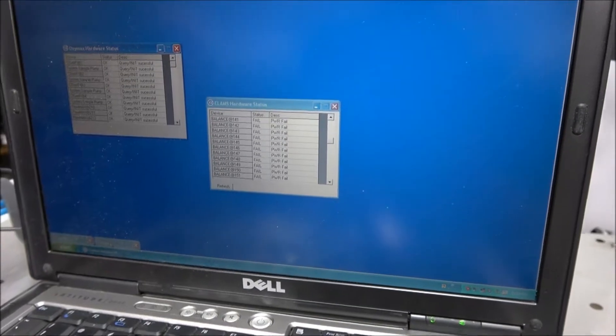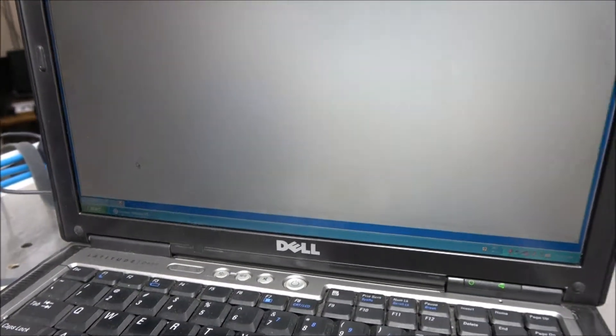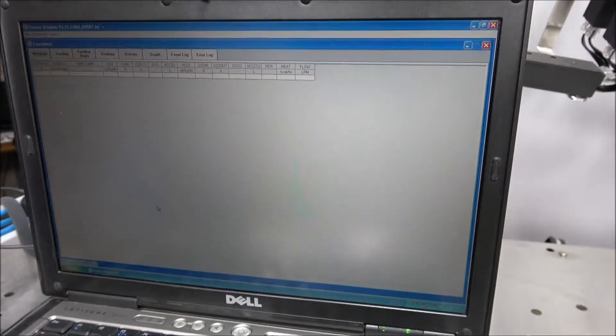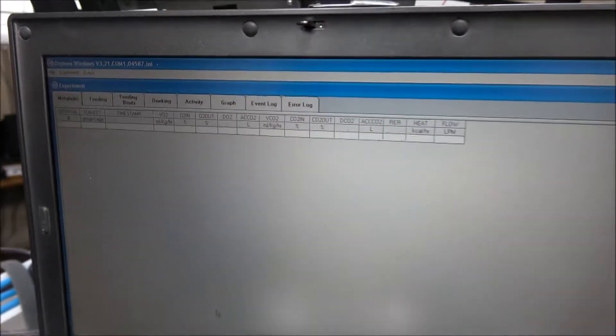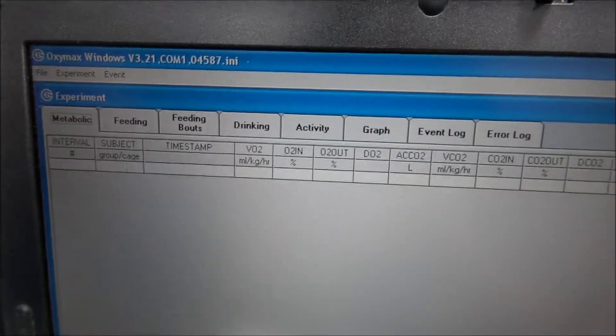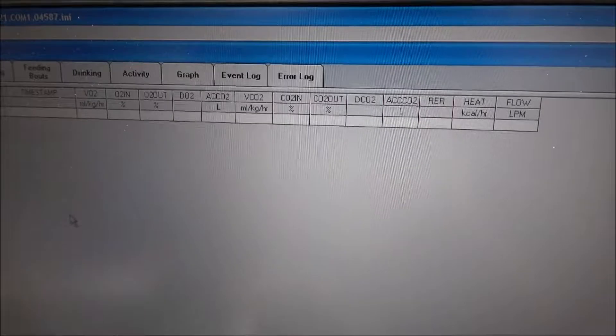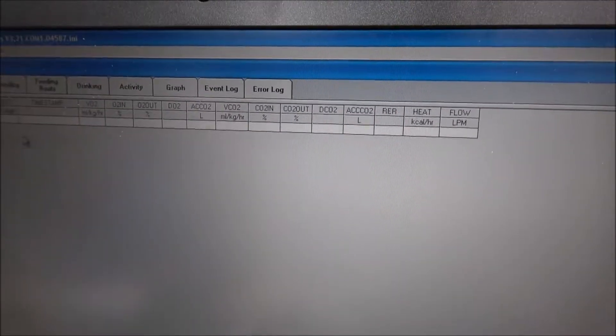We're going to go ahead and look at an experiment menu here. The data recorded with this instrument is in comma-separated values. The end user needs to support their own analysis software to organize as well as graph their data points. The technicians note that the software is designed to control the instrument and record only.